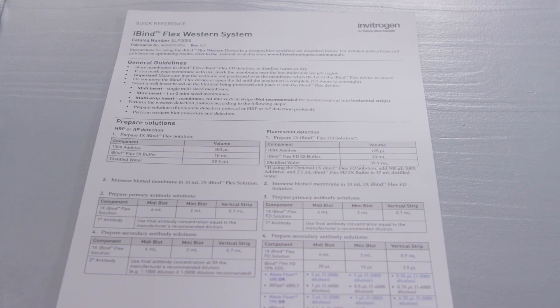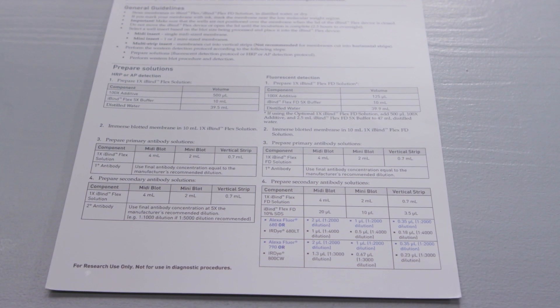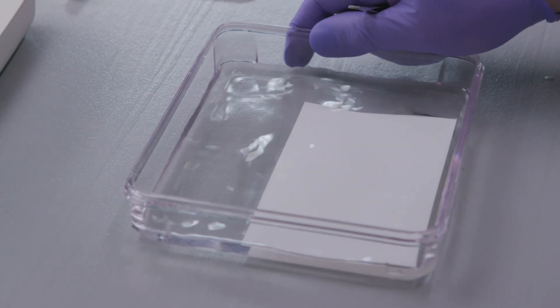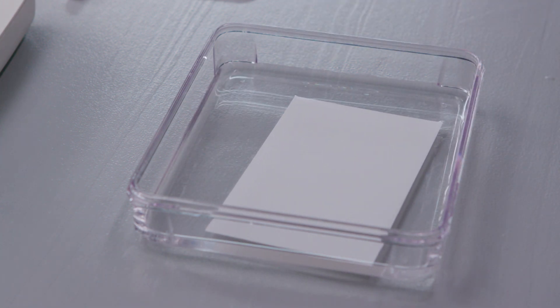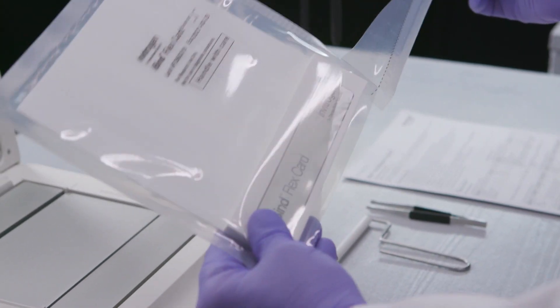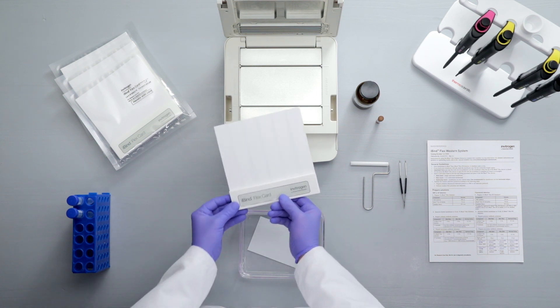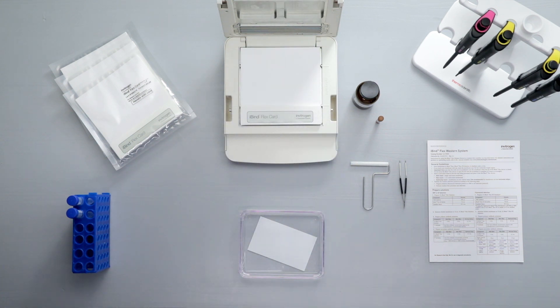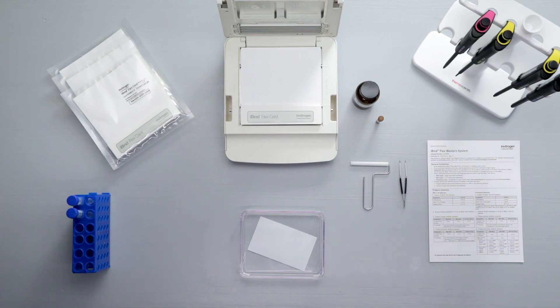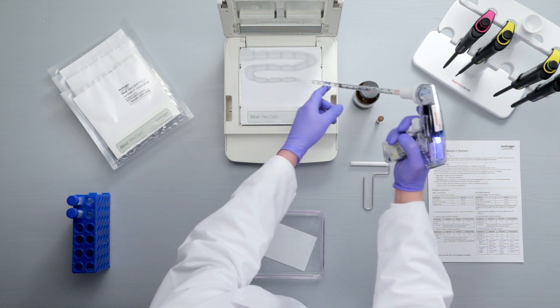Start by preparing your 1X iBind solution and your primary and secondary antibody solutions, according to the quick reference card. Next, place your blot or blots in 10 milliliters of 1X iBind solution after the transfer step. Remove an iBind card from the pouch, taking care to handle it by the bottom, thicker portion only. Place the card in the device, making sure it is aligned against the backstop. Do not use cards that have been bent or damaged. Wet the card evenly with 10 milliliters of 1X iBind solution.